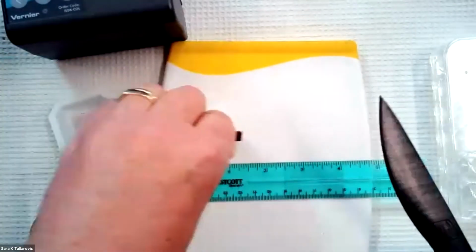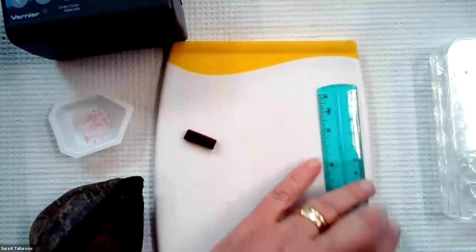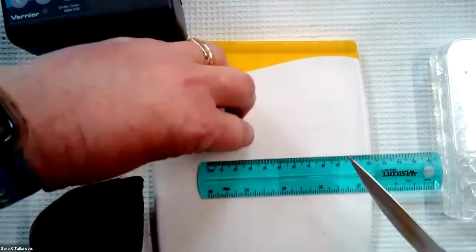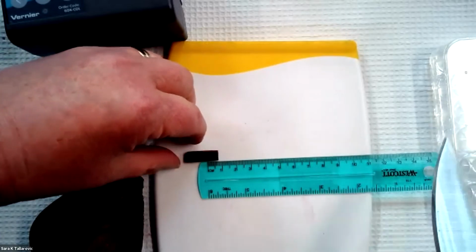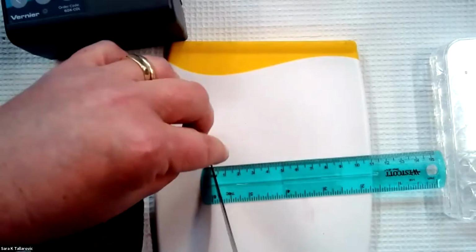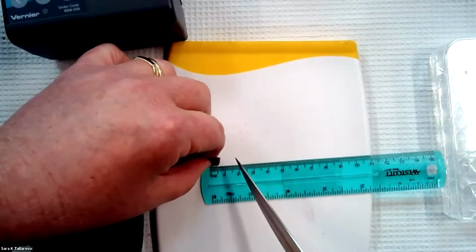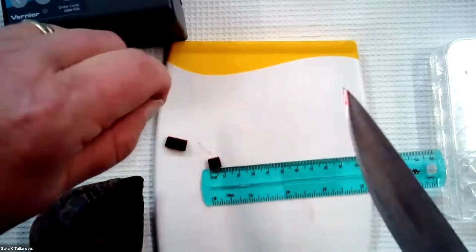So the idea is you want a piece, oops, let me switch our scale over here. We want to get a piece of beet that is approximately 0.7 centimeters, so 7 millimeters, and you want that in all dimensions. After a while, you get kind of good at gauging the size of your piece.